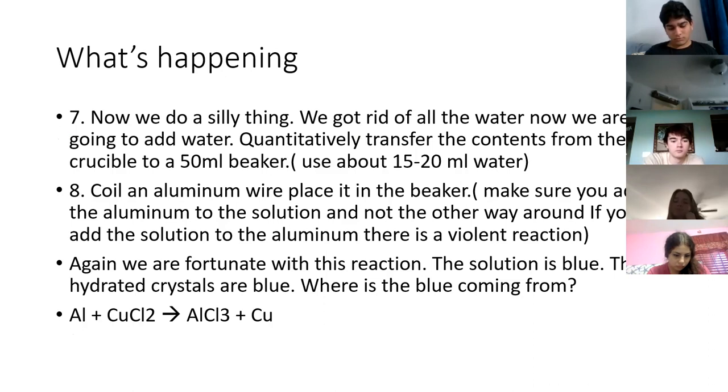How do I know a reaction is occurring? Two indicators. Color change, form of a precipitate, temperature change, anything like that. Absolutely. Who answered that? Larry. Good, Larry. Absolutely fine. I'm getting precipitate. I'm getting the copper being formed. It's a different color than aluminum. That's one thing I'm noticing.